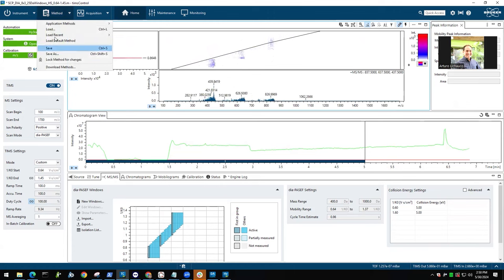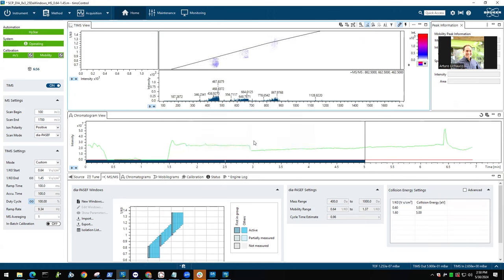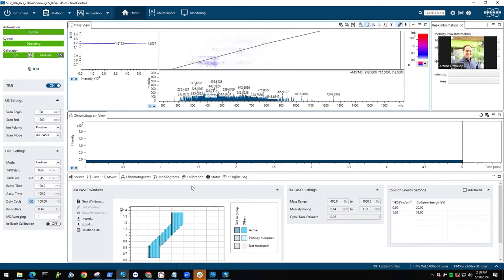So I just load the method again. That's how it looks when we apply collision energy. So you see signals appearing at lower mobility because we are fragmenting something. Right now we only have background there, but we would then start fragmenting peptides and collect peptide spectra.